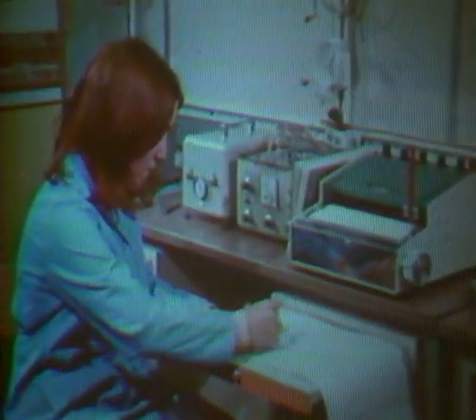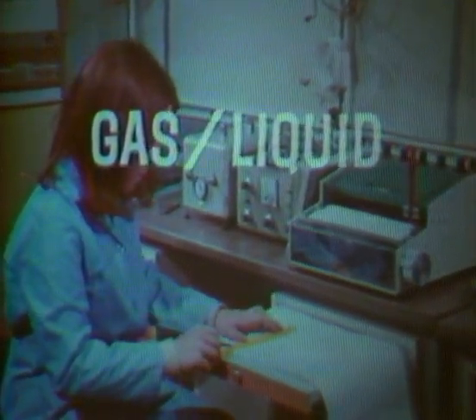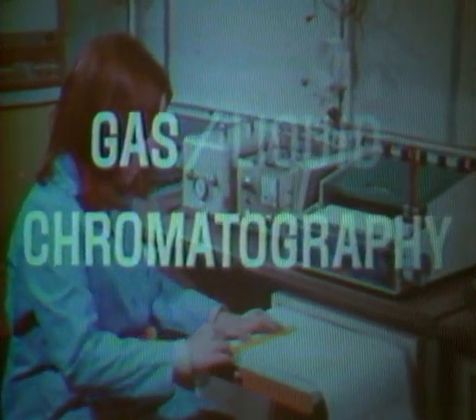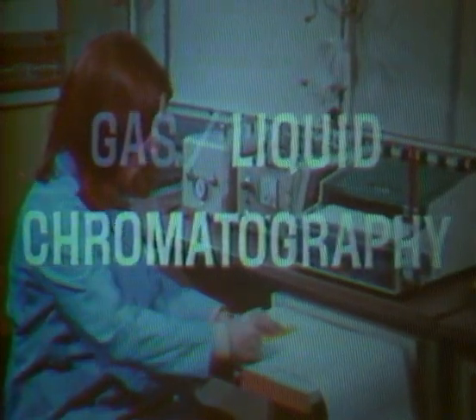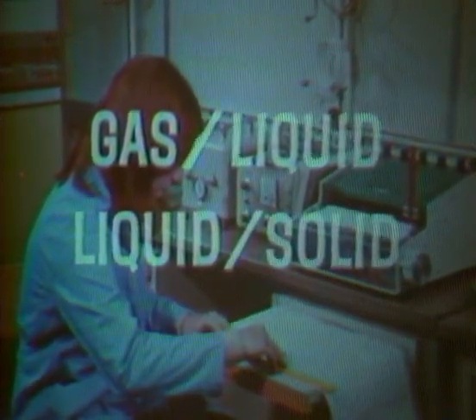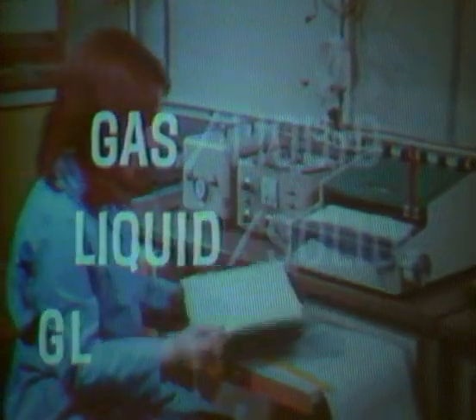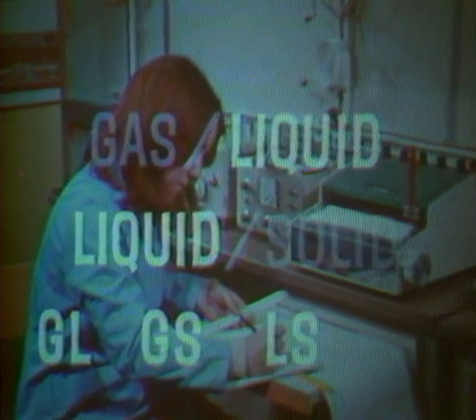The mobile phase may be either gaseous or liquid. Where the mobile phase is a gas, the technique is called gas chromatography. Where the mobile phase is a liquid, it's liquid chromatography. The stationary phase may be either liquid or solid. The combinations of these give us the four types of chromatography: gas-liquid, gas-solid, liquid-solid, and liquid-liquid.